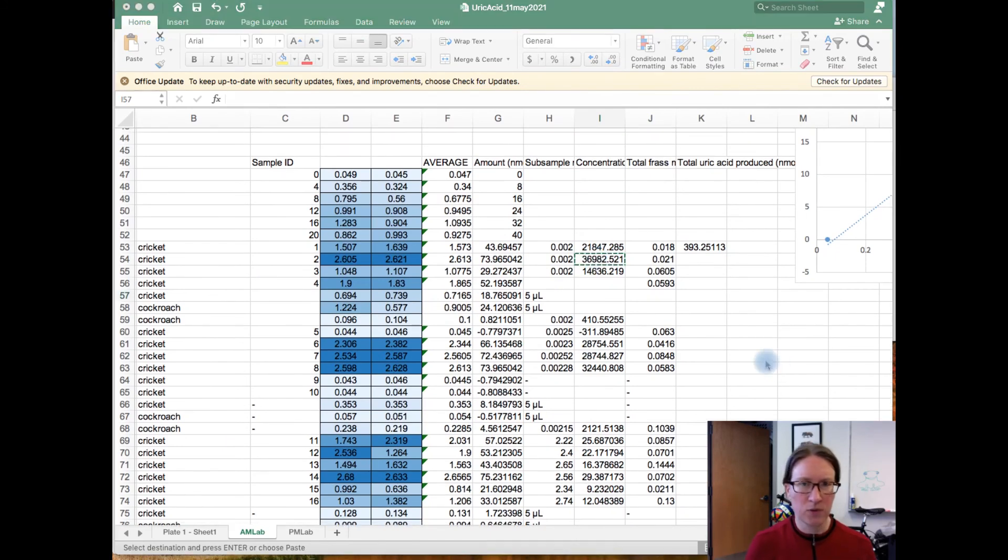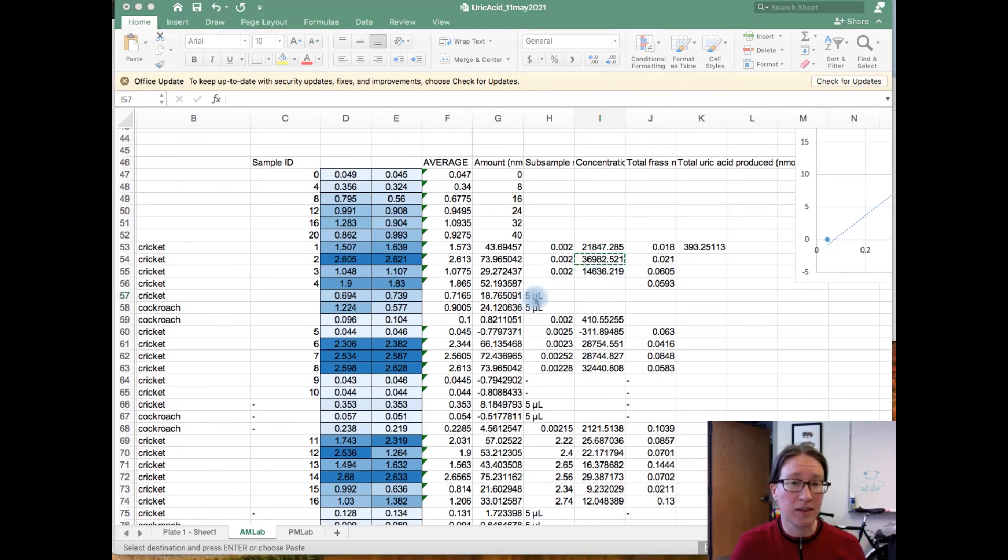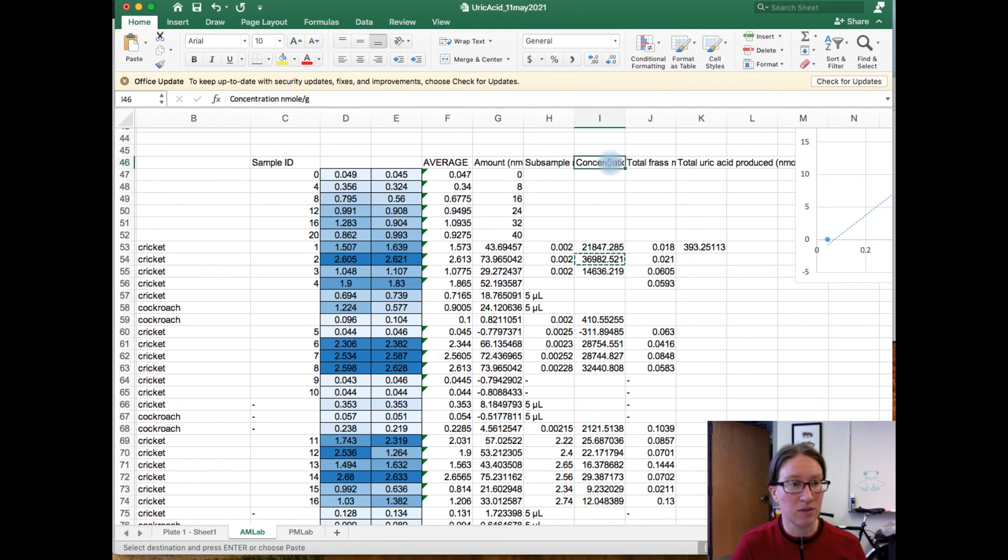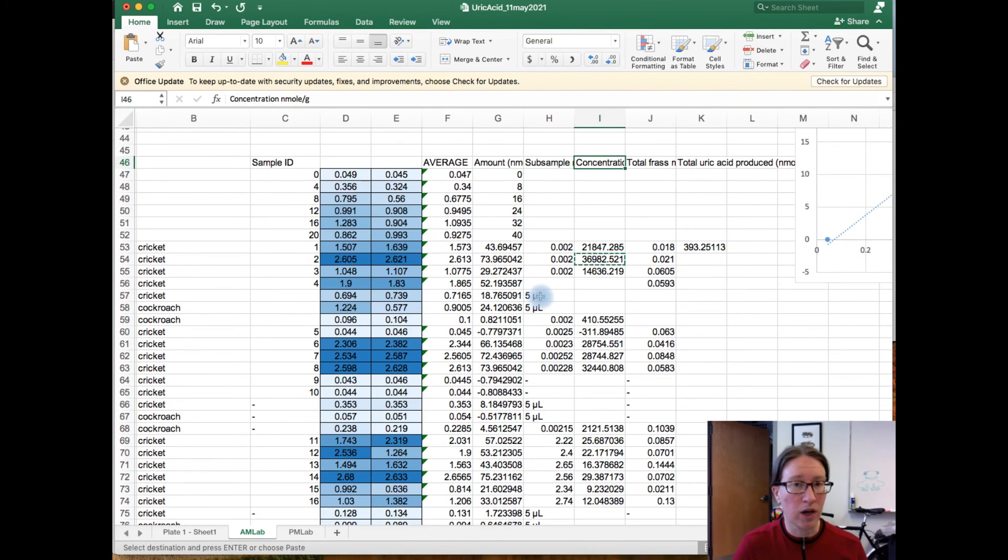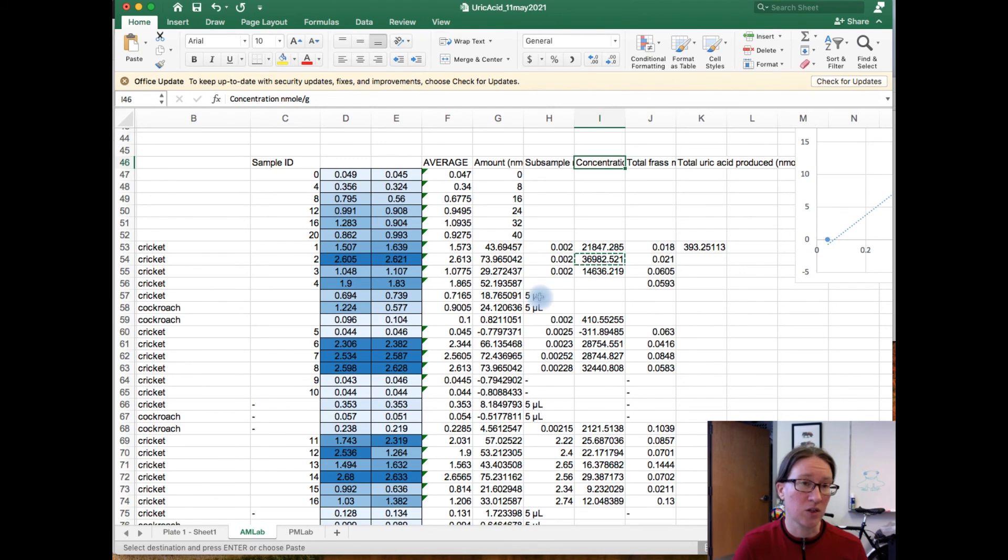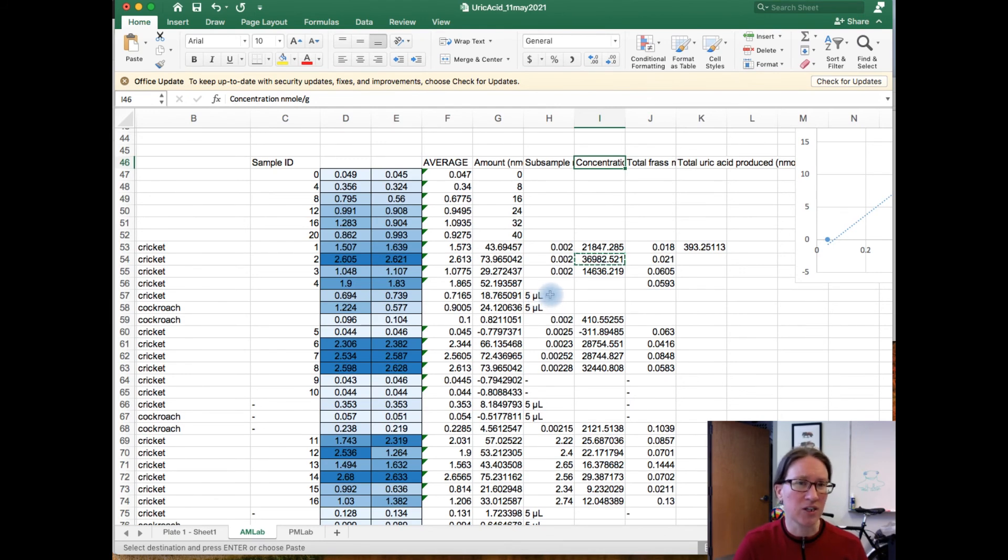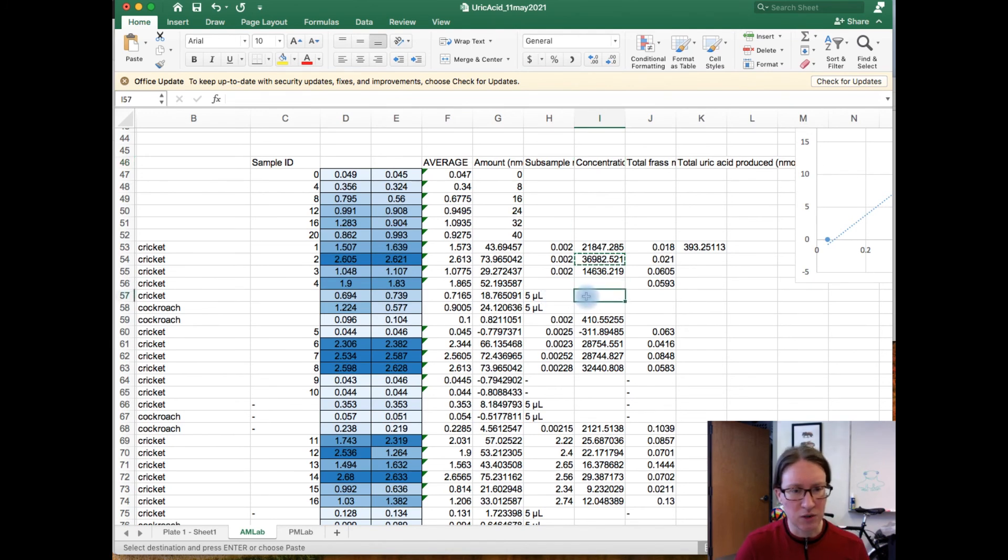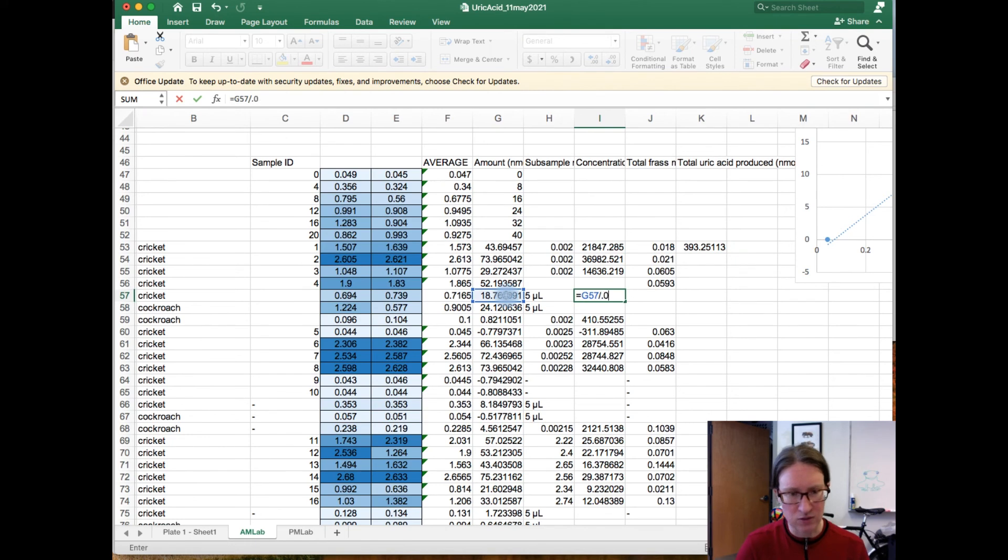So now for our samples from hemolymph, we can actually convert this to the same units of nanomoles per gram if you know that one microliter is equivalent to one microgram, so that's also 0.001 grams. So 5 microliters is going to be equivalent to 0.005 grams. So here what I'm going to do is I'm just going to take that and I'm going to divide it by 0.005 grams.